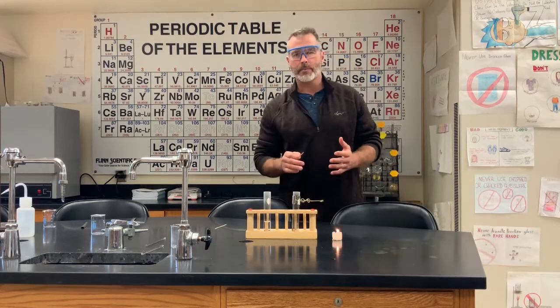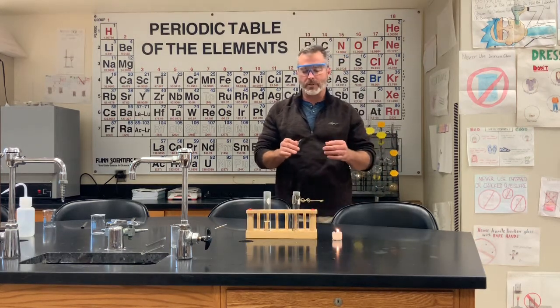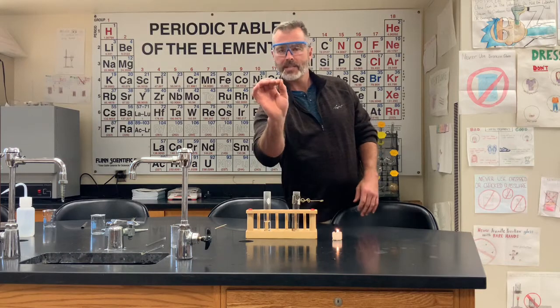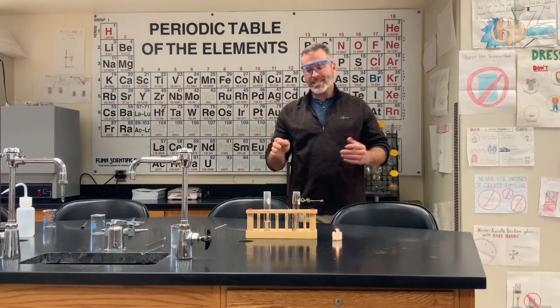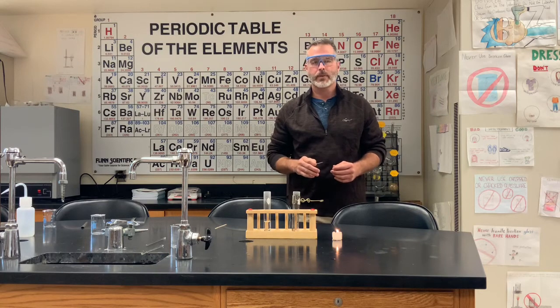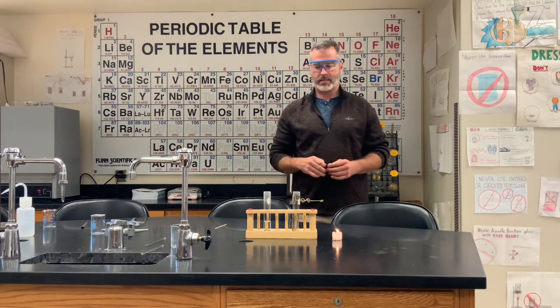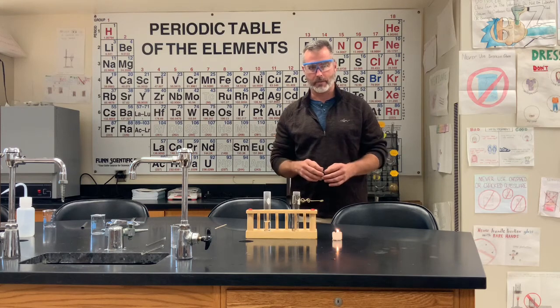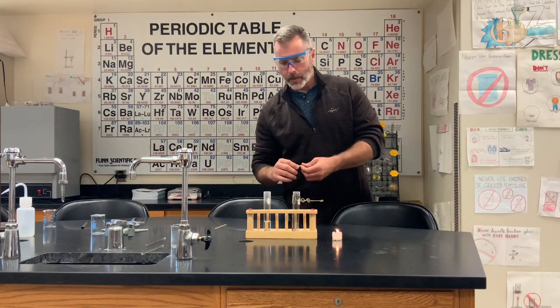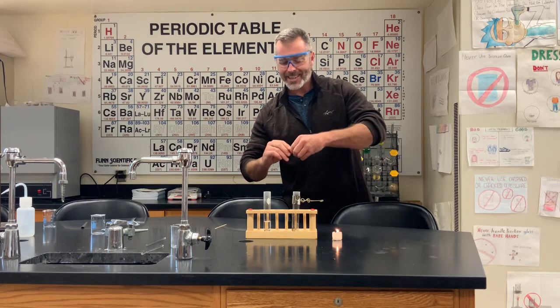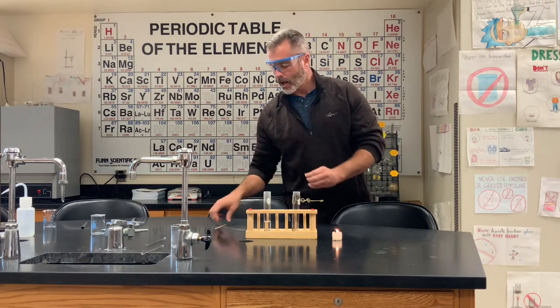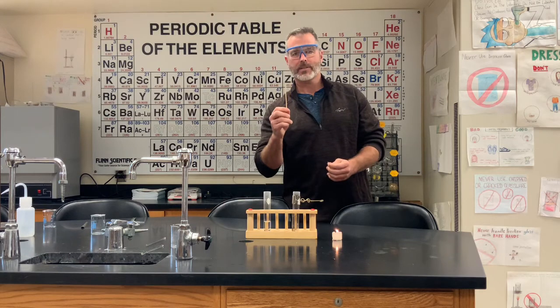All right, we're back with another demonstration. We're going to have a little two-for-one special here. First one we have is a piece of magnesium. The piece of magnesium is going to go into about six molar hydrochloric acid. We're going to produce a gas. Hopefully it's not the chlorine portion of this, or I might not make the next demonstration. So we're going to make gas evolve from this. Then when we get that gas, I'm going to hold a splint up to it, and we're going to see what happens.